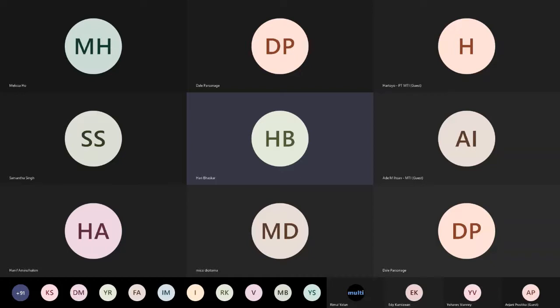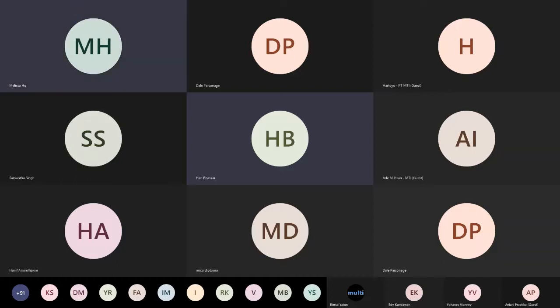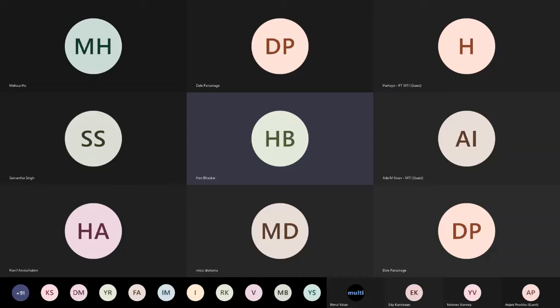So the instrument, let's say if you're talking of the Zetium or any WDXRF, there are a lot of dynamic parameters inside, like temperature, vacuum, water flow, cabinet temperature, and so on. They keep changing, and they all have an influence on the X-ray intensity coming from the sample on a day-to-day basis. So a monitor sample is used, and this monitor sample needs to be a very stable sample, not a pressed powder or a loose powder. It has to be a glass bead or a metal. And when you set up a calibration, you measure this sample for the elements of interest, and it registers the count rates of those elements.